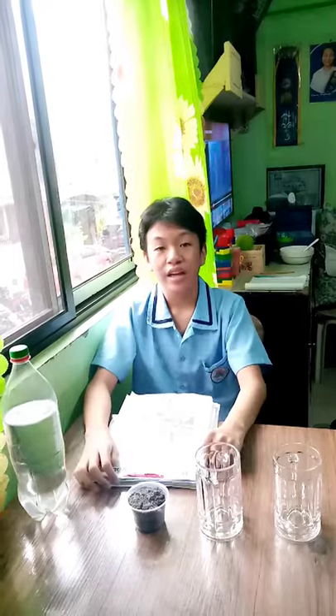Hello, teachers! Hello, classmates! Today, we will be separating mixtures by decantation, evaporation, and filtration.